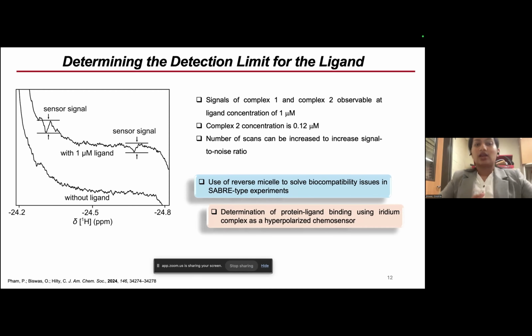It's a very amorphous question. Let me be more clear. Can you comment on that very impressive sensitivity of 120 nanomolar and where you might expect the detection limit will ultimately end up? Maybe that's around where it's going to end up.